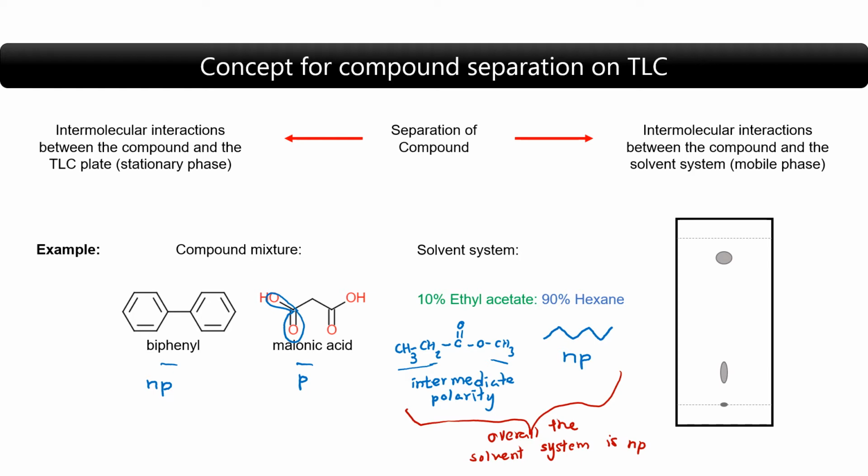Now, if we have the TLC plate, remember the TLC plate is always more polar, and we have applied a spot of our compound mixture, and we developed this TLC plate in this solvent system. How would these two compounds separate?